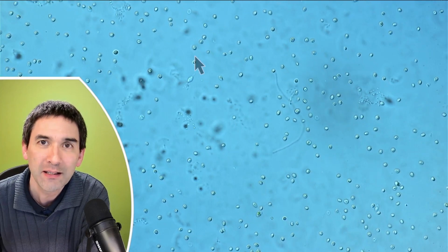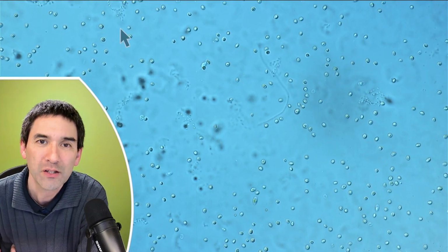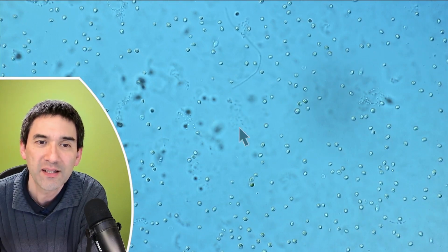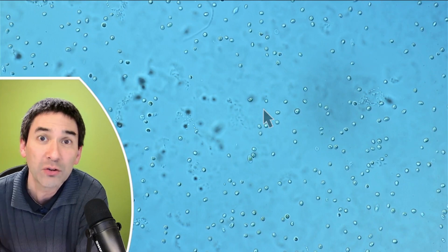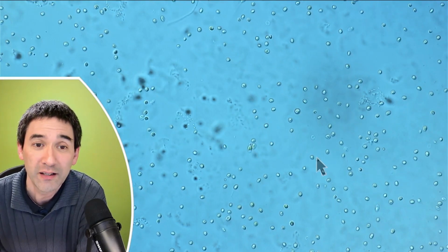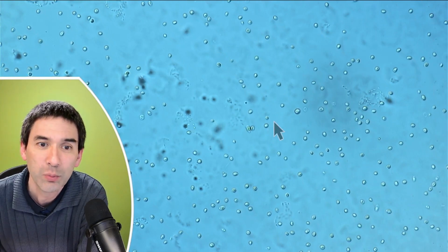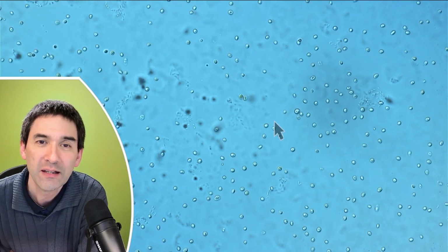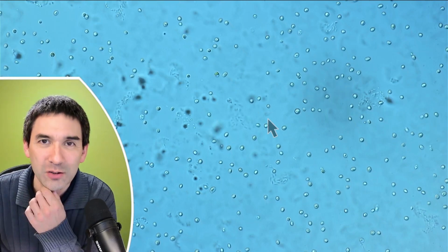And mathematically, when this happens, they will actually move statistically towards the area that's more favorable. So let's say there is some kind of a gradient of something, let's say an oxygen gradient, right? And there's more oxygen here in the center than on the side, but the stimulus is not coming from a particular direction. It's just generally like that. So what they will actually do is, as soon as they reach a more favorable condition, they will simply start moving around with shorter runs and more frequent turns, and then they will tend to stay in that area longer, right?